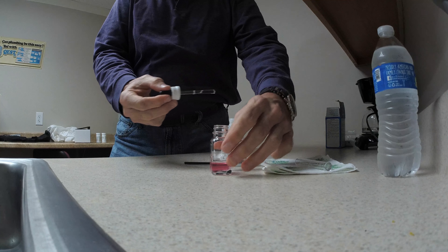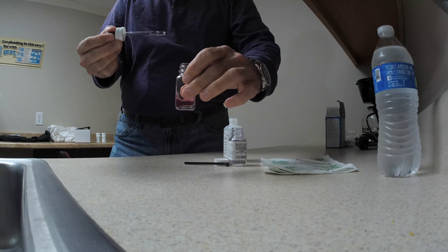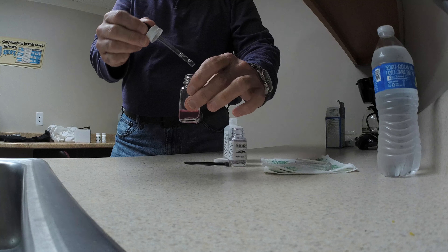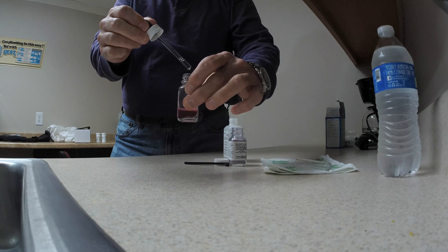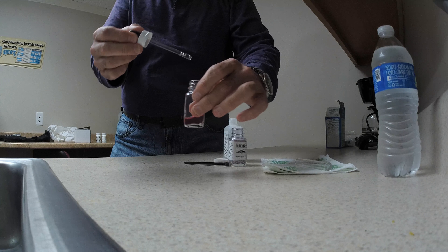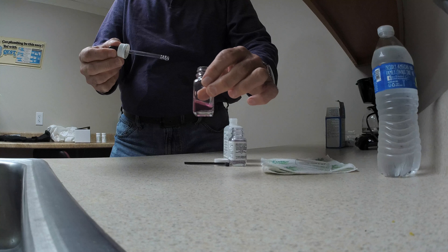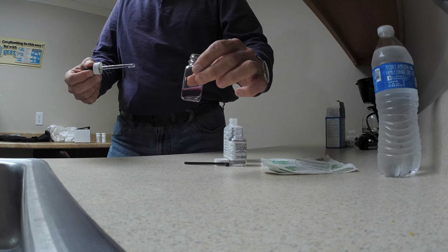So we'll put a drop in and give it a little shake. We'll do one, two, three, four, five, six, seven, eight, nine, ten, eleven. You can see how the water turned blue at eleven — it shows it has a hardness of eleven.